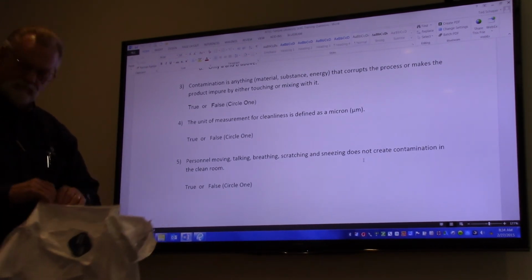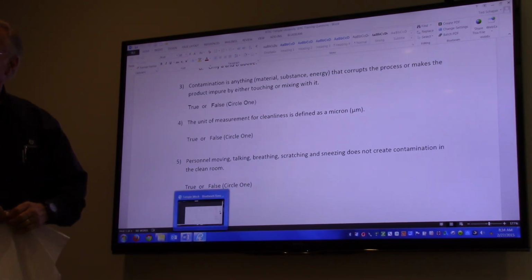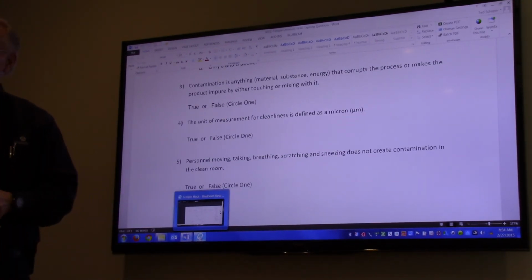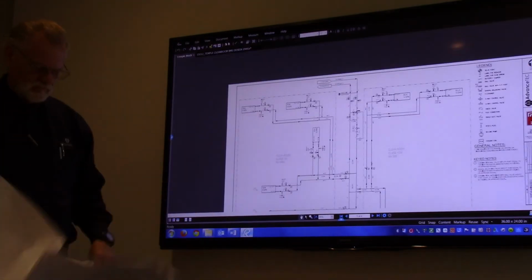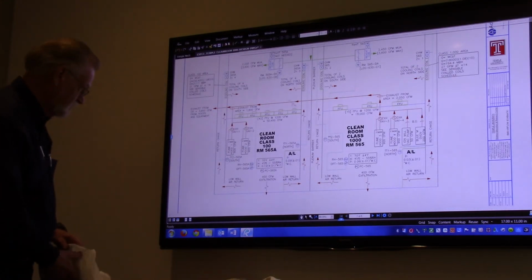Couple more questions. What are the conditions inside of the hoods? It is, I believe, 2 hoods in the 100 space, and I don't remember what is in the 1000. But what are their conditions: temperature, pressure, humidity. Oh, okay, we can get that.